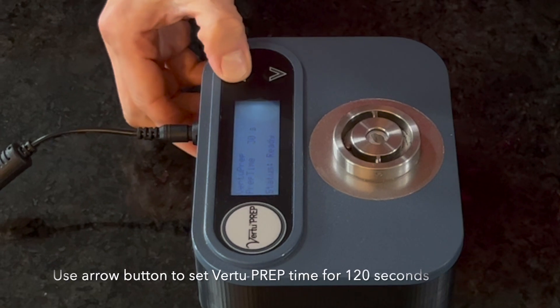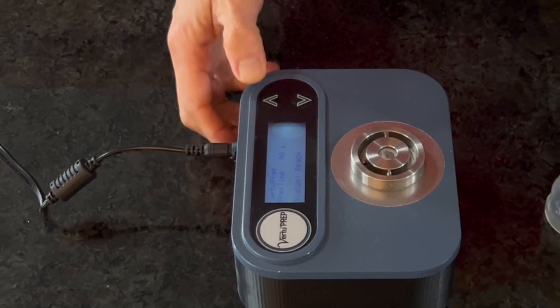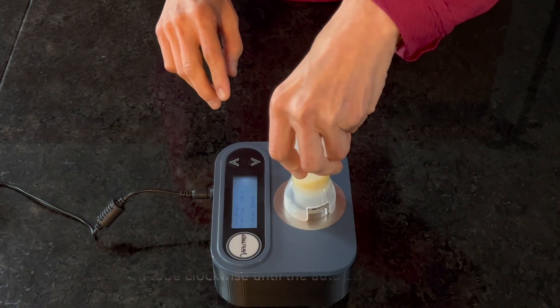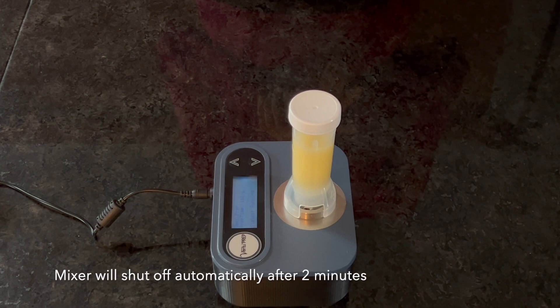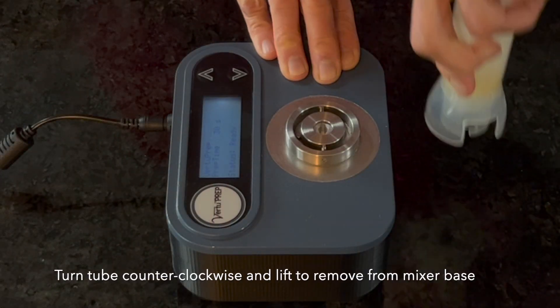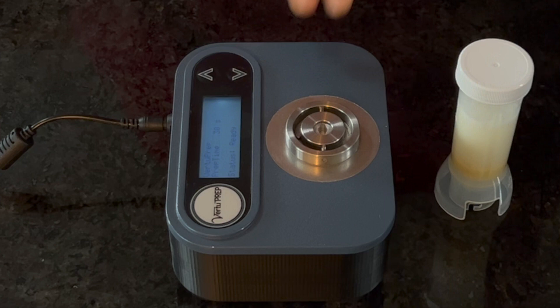Use the arrow button on the VirtuPrep mixer base to set the onboard timer to 120 seconds. Press the VirtuPrep extraction tube onto the mixer base and twist in a clockwise direction until the locking mechanism engages. Once the tube is in place, mixing begins automatically. The auto shutoff feature enables walk-away automation, resulting in precise and reproducible extraction.